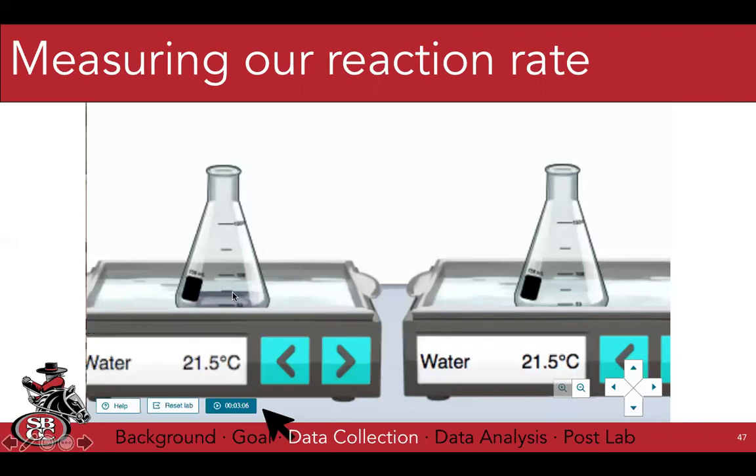I gave you that video of the endpoint because it is less clear in our simulation. This is the endpoint. This is what you should see. I'm going to really illustrate this because you won't be able to do this experiment unless you can see the endpoint. As soon as I see that color change, and one thing I noticed from doing this experiment a few times, the simulation does this weird thing.